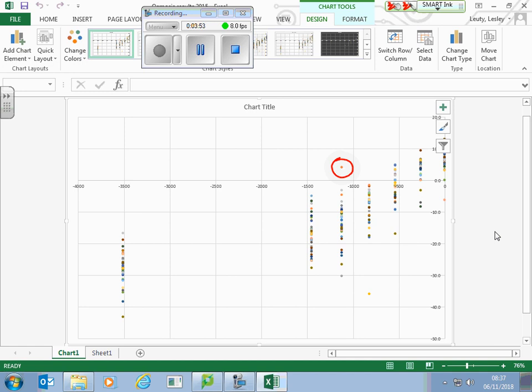Along with the next one here, this one is just so way off the rest of them that I would call that an anomaly. Bit borderline, but I'm also going to take that one as an anomaly because it is an odd one. There's not a spread going out there. And then this one is that obvious one where we've got a negative value in pure water.